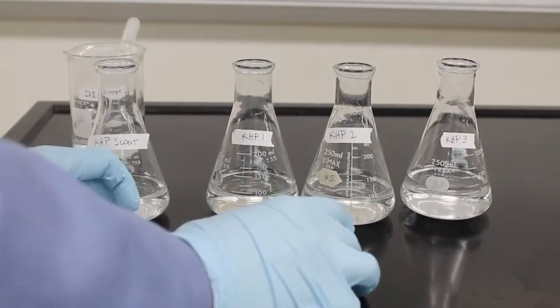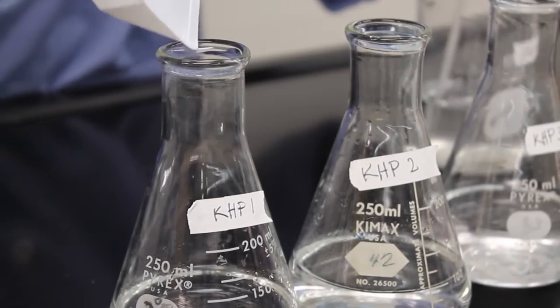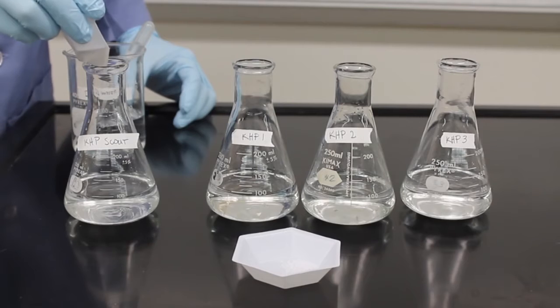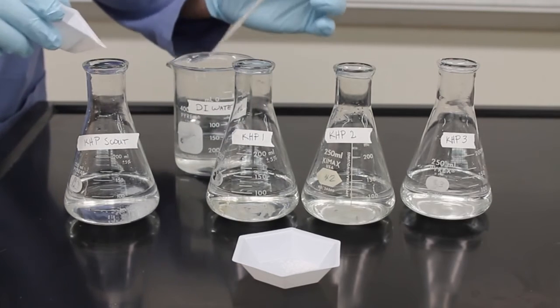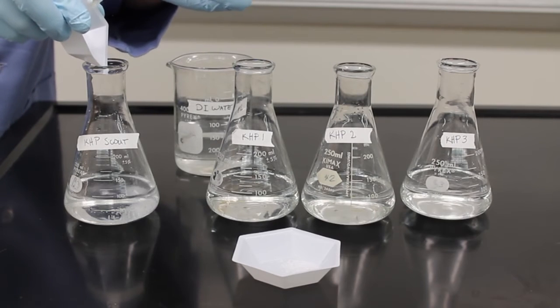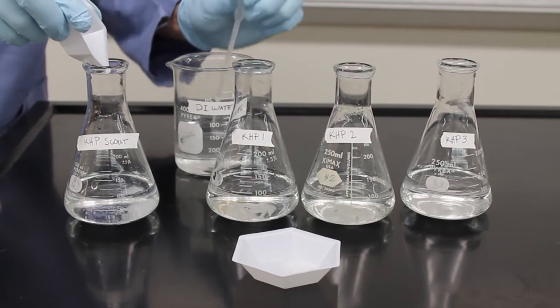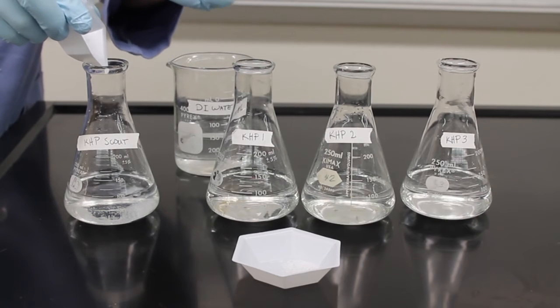Next, you will need to transfer your KHP to flasks that contain approximately 100 milliliters of water. The exact amount of water doesn't make a difference, but the exact mass of KHP does. Remember, this is deionized water, not regular tap water. Rinse your weigh boats out 3 or 4 times with deionized water to ensure you get all your KHP transferred. This technique is called a quantitative transfer. Another technique that you could use is called massing by difference. See the description below for a link to the balance video for this technique.